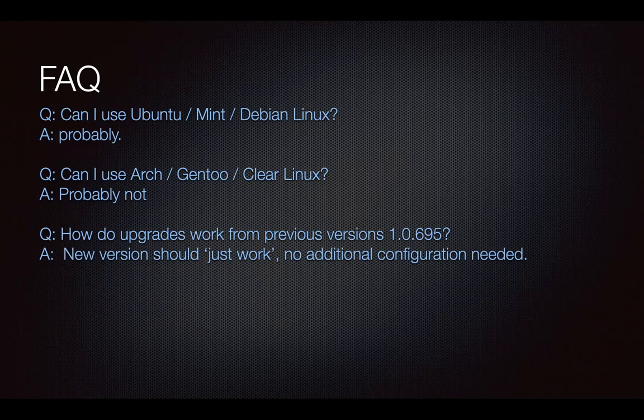Most things work. We package things so that they work pretty well and they're relatively portable, but you may run into some surprises. You can drop us a line and let us know when it's broken on the platform you'd like to use. Odds are pretty good we'll fix it, but we can't warrant that you won't run into issues.